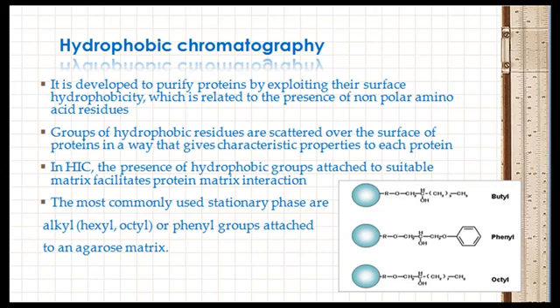The group of hydrophobic residues are scattered over the surface of the protein in a way that gives characteristic properties to each protein. In aqueous solution, these hydrophobic regions on proteins are covered with an ordered film of water molecules that effectively mask the hydrophobic groups.